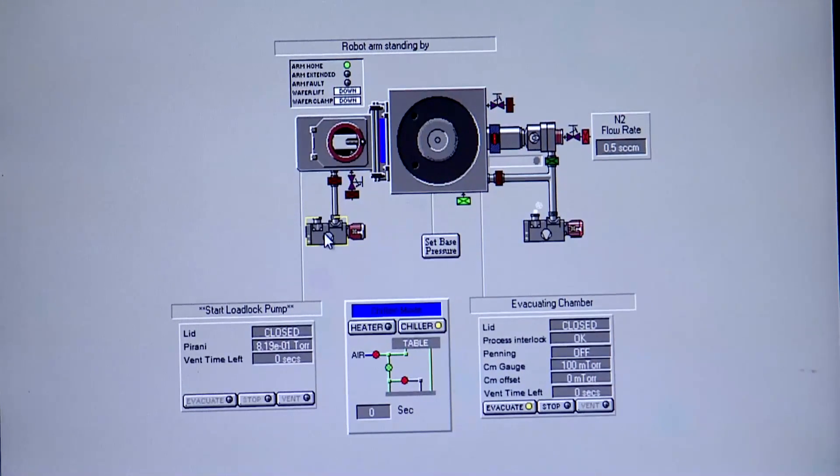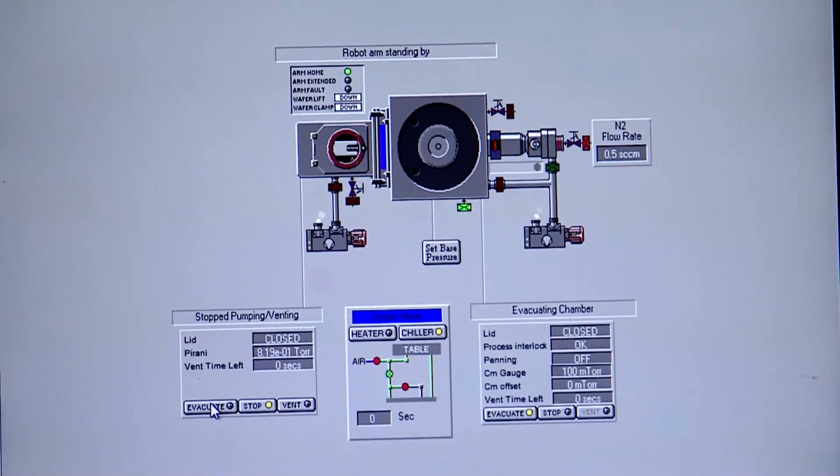In the meantime, we turn on the pump in the load lock side to evacuate it.